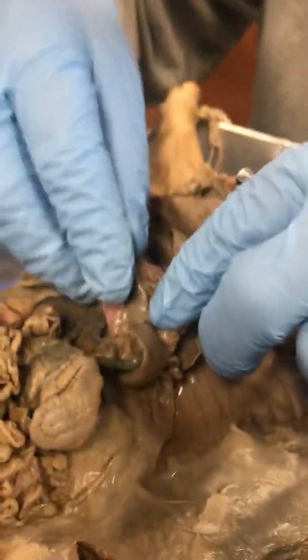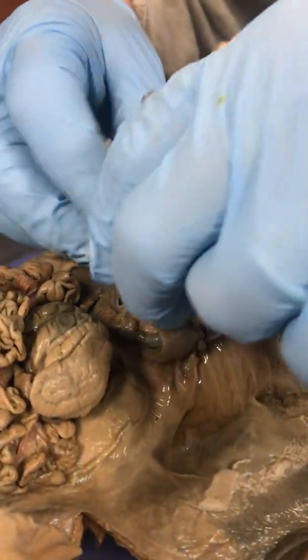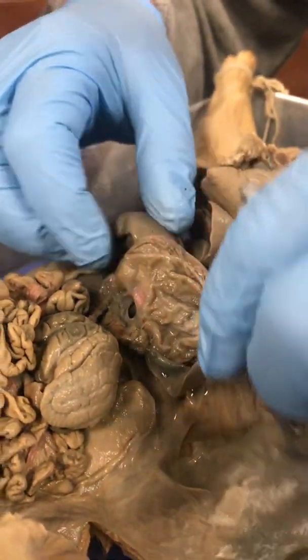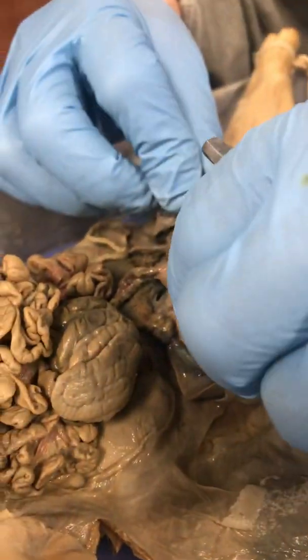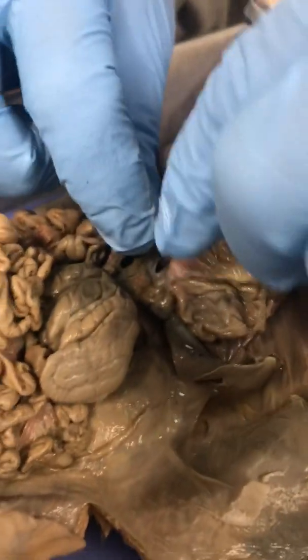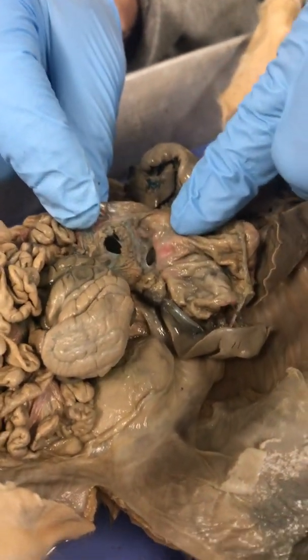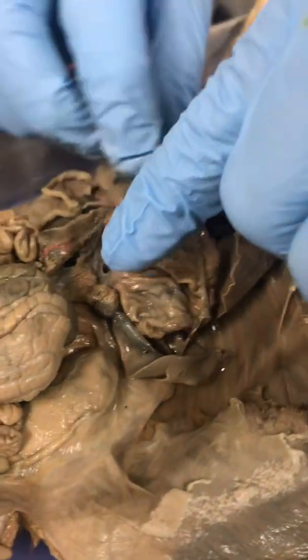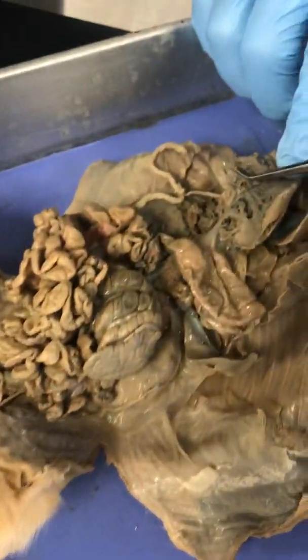Here, this extension, this organ right here, is the spleen. What's one of its major functions? To get rid of the old red blood cells. Right, to remove old red blood cells. And of course, if this is the stomach, this first part of the small intestine right there has to be the duodenum. Now, another reason you can know that is, here's the liver, this big organ.